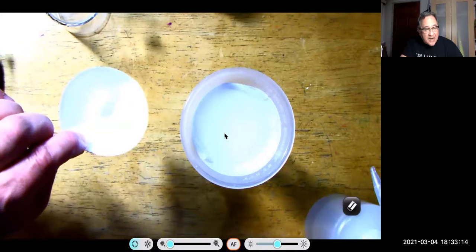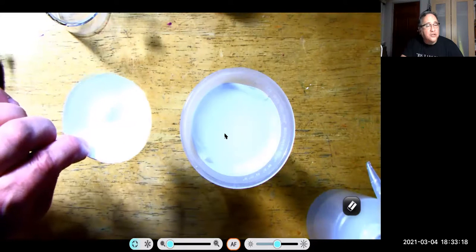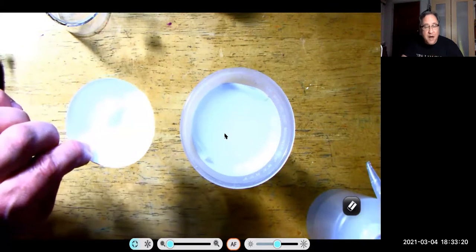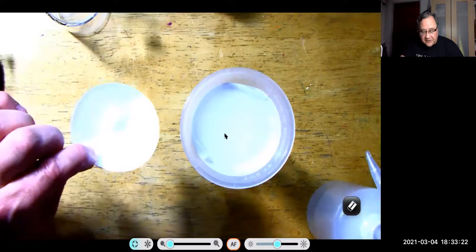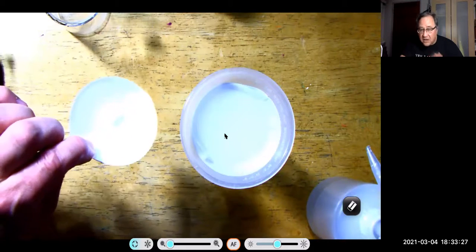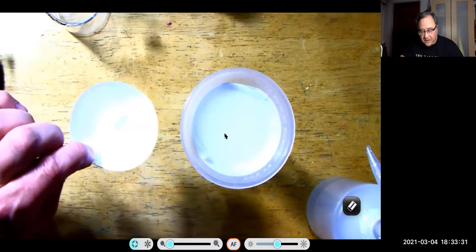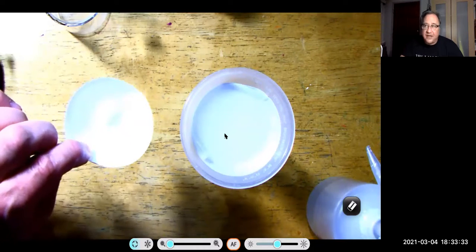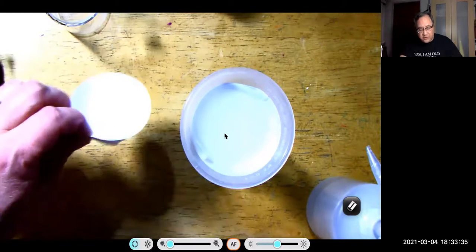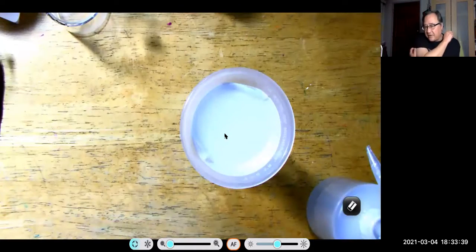As it rinses down, it'll be bringing the ions with it to the bottom of the filter paper and eventually out of the bottom. Now, the ions I'm talking about, of course, are the ones that are not part of the solid. You want to rinse this about 3 times. If you're rinsing with like 2 or 3 milliliters at a time, each rinse is going to take you anywhere from 3 to 5 minutes, depending on how much you use.